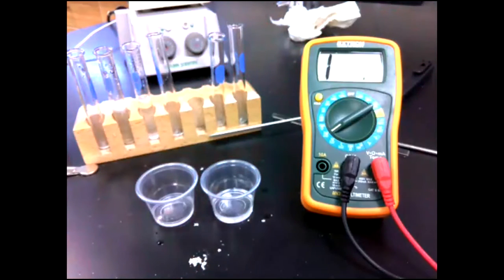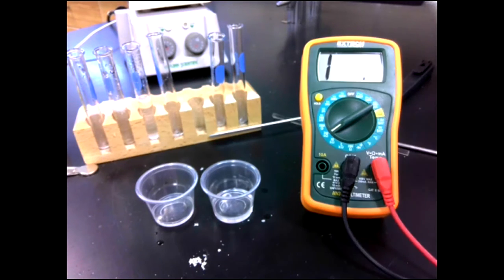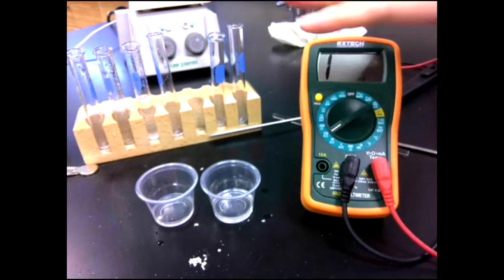The liquid that it's in doesn't really matter. It's really about B: it is dissolved, but it does not conduct electricity. And so later on, we'll talk about why that is once we figure out what the compounds are. Okay, so any questions about conductivity?